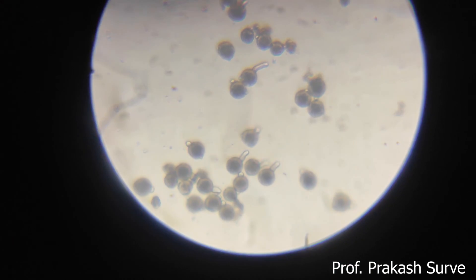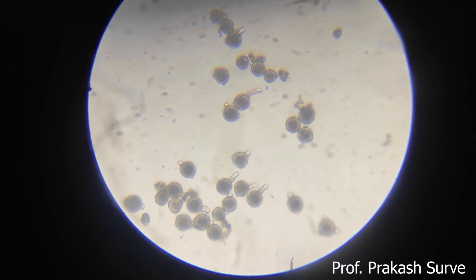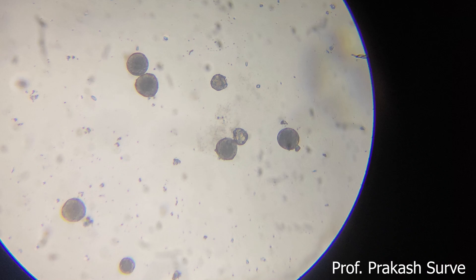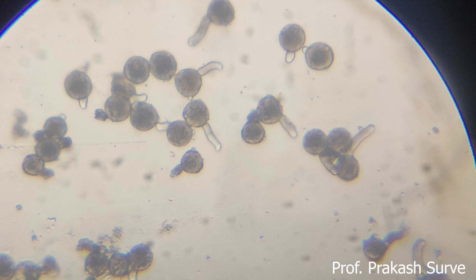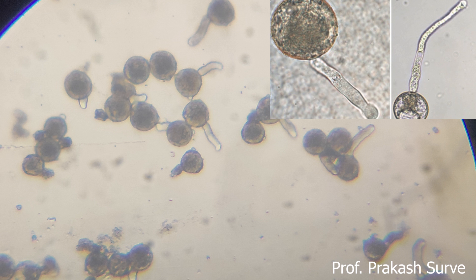On this sugar solution we have taken the pollen grains of the Vinka flower. This is the initial stage, and this is the final stage when the pollen grains are germinated and form the pollen tube.